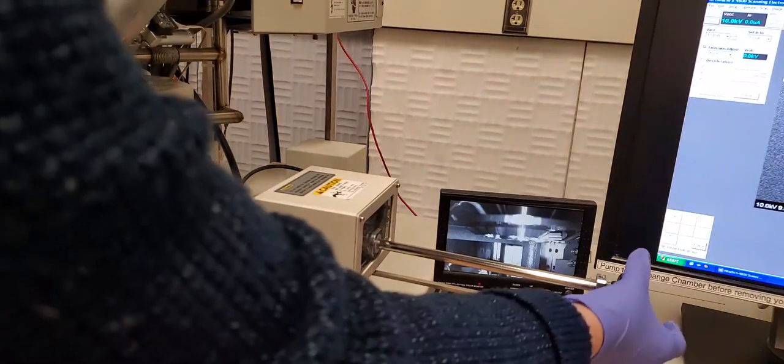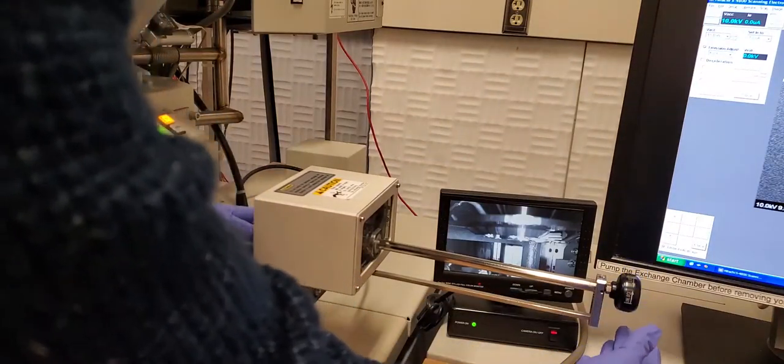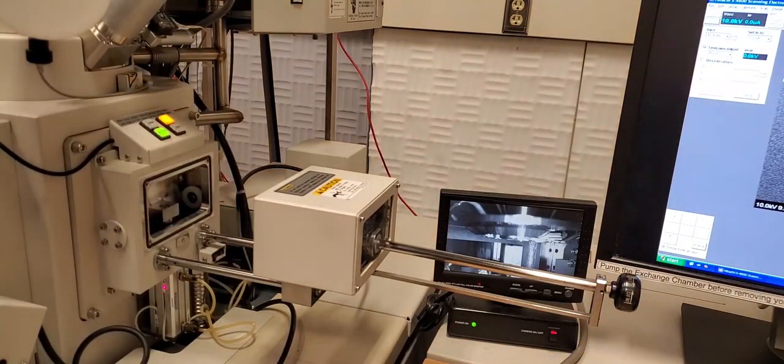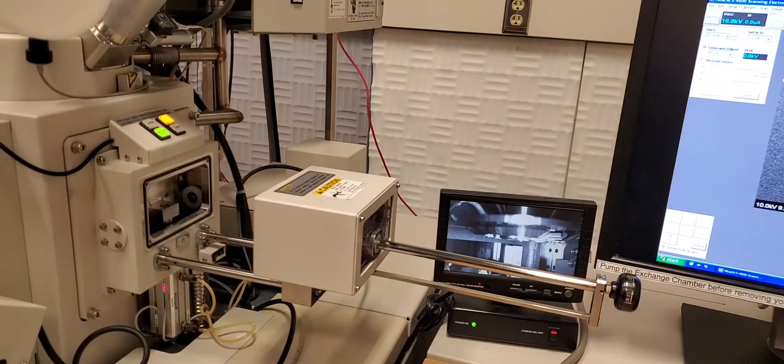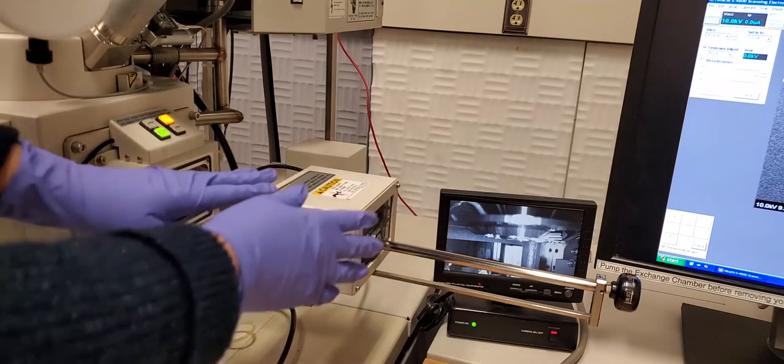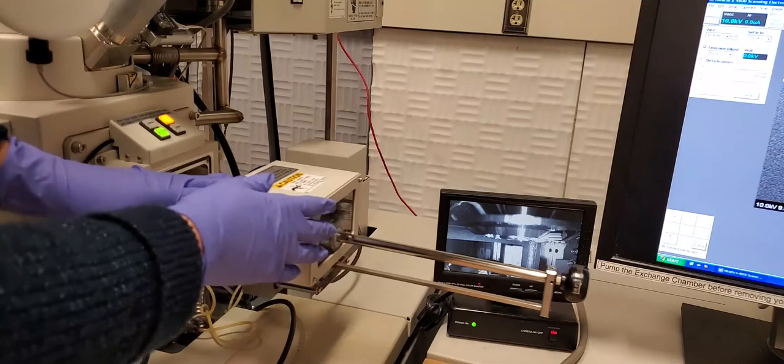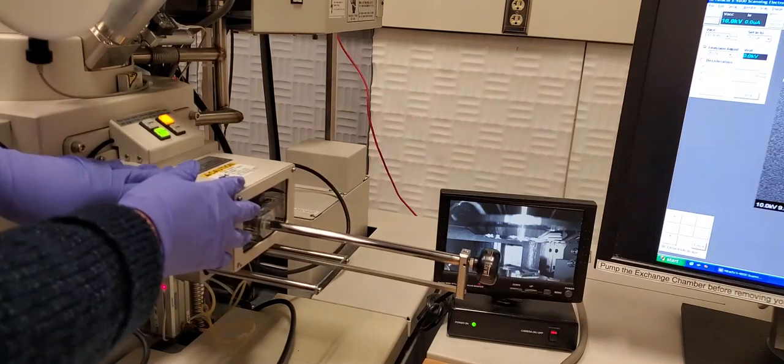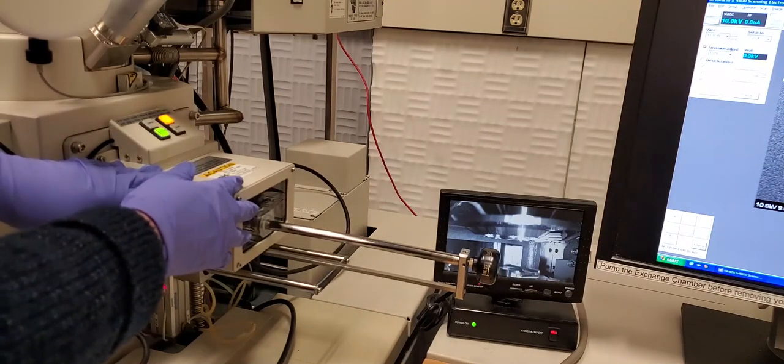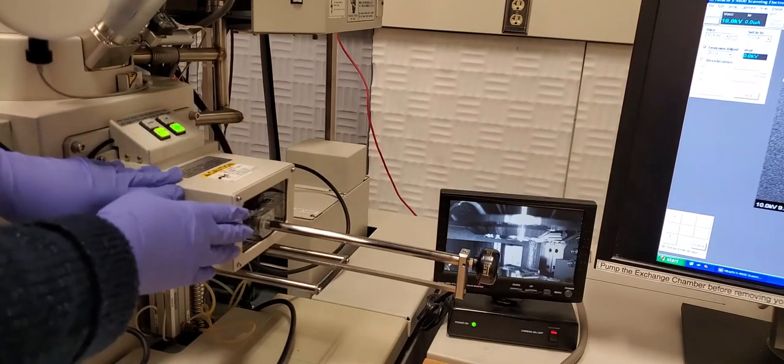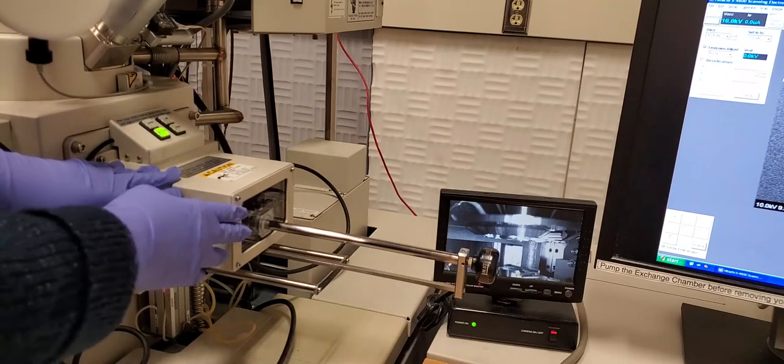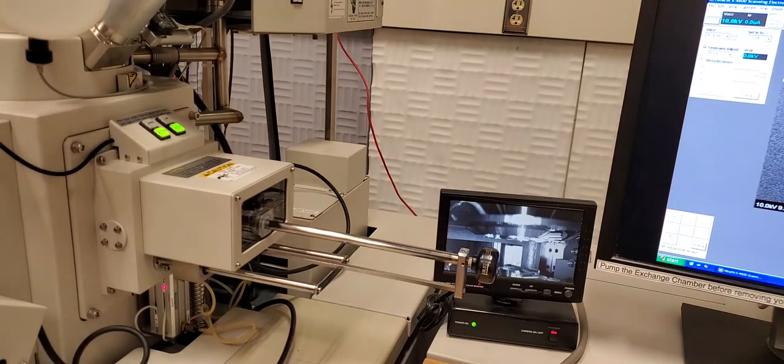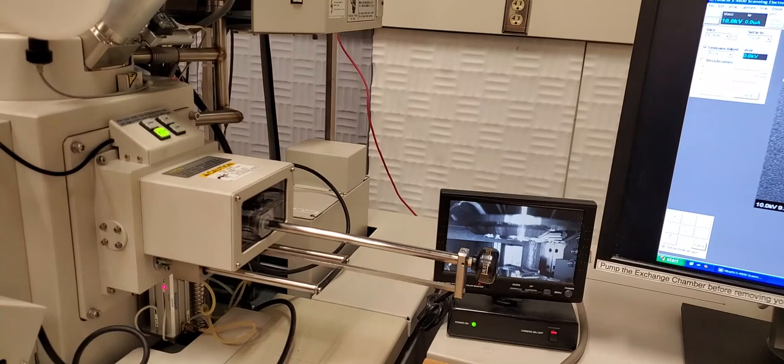So now we'll close the door. So now we're ready to press the evac button, put the sample chamber back under vacuum. You'll also hear a beep when this process is completed.